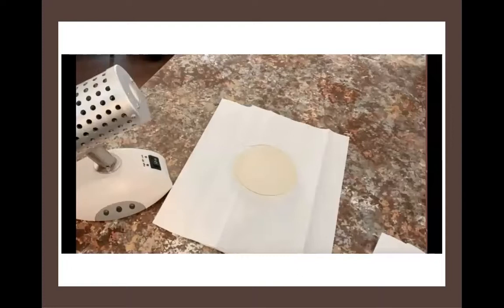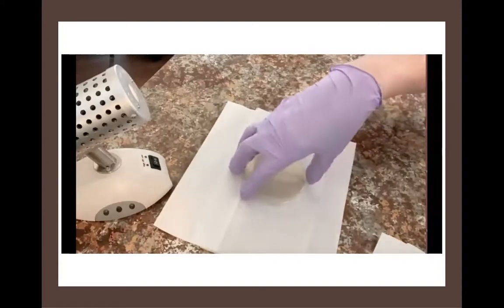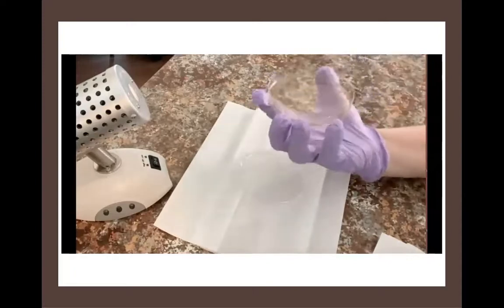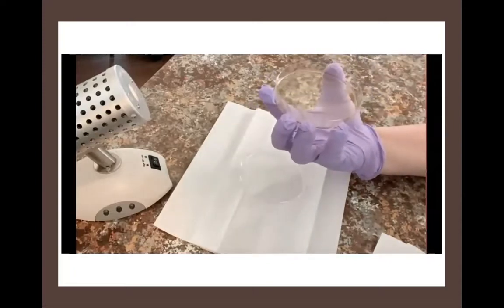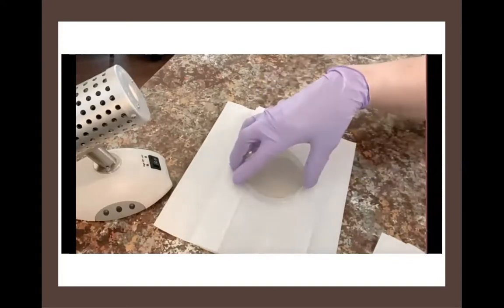Now let's take a look at a couple of ways that you don't want to handle your agar dish. First of all, you never want to just open up an agar plate and hold it straight up to the air like this. You're just asking for contamination to fall onto that plate. So don't do that.